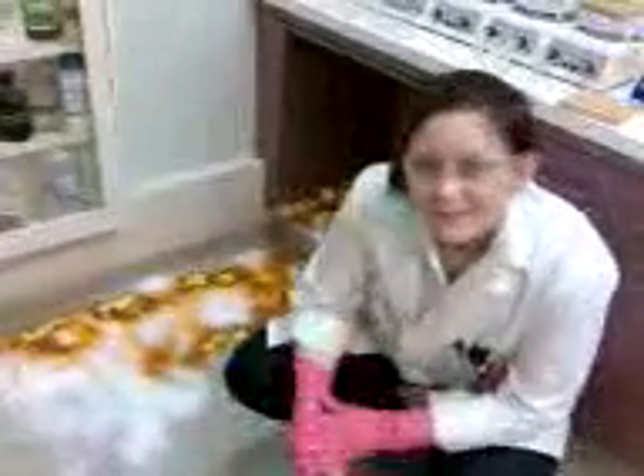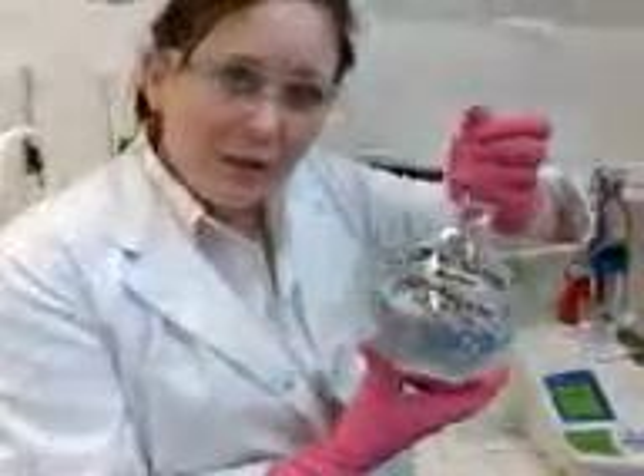What I did was, being the clumsy person that I am, I smashed a full bottle of this — which is mercury sulfate solution. The mercury sulfate solution smashed and poured all over through this area here.